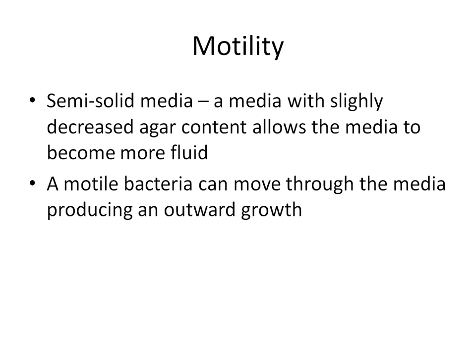As far as determining whether our bacteria is motile or not, we simply look for cloudiness in the media. This is not something that we can really do by looking at a picture through the computer. This is the reason that we will inoculate the media in lab so that you can see the cloudiness yourself.